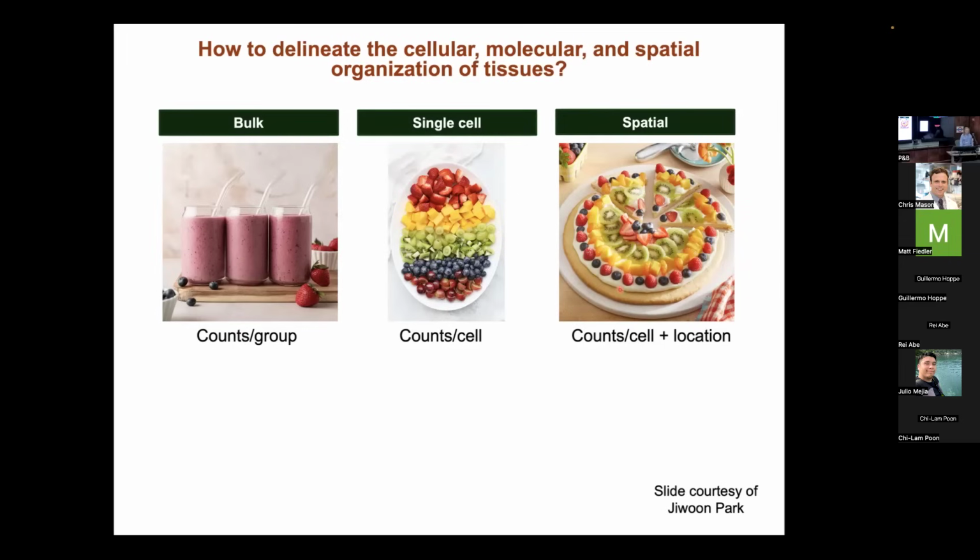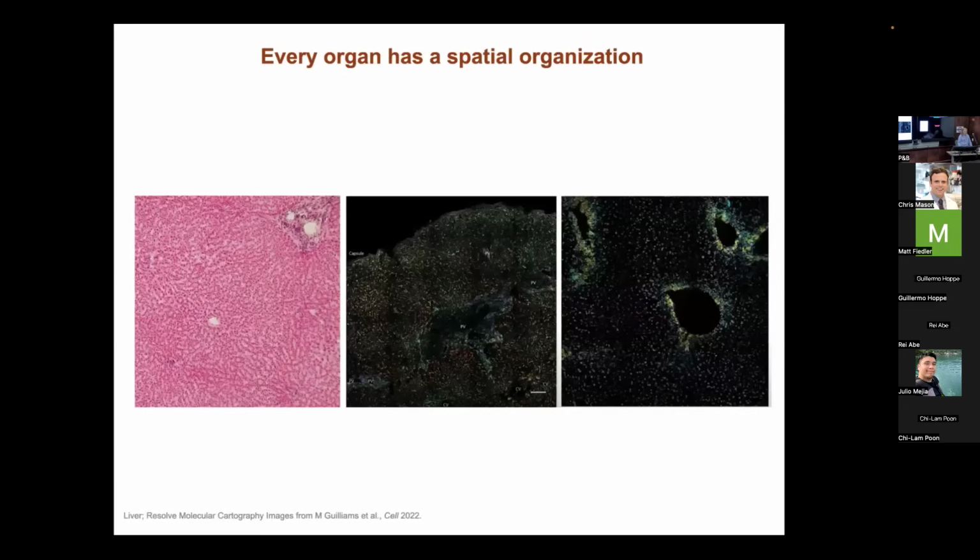So you can see how much more information you can derive, especially in organs that appear on the surface homogeneous but really are quite heterogeneous, where this can be quite groundbreaking. And obviously I'm a little biased, so I'm just showing you here some livers, the liver architecture. On the surface it's like, oh yeah, this all looks the same. But I'm here to tell you that it's not.